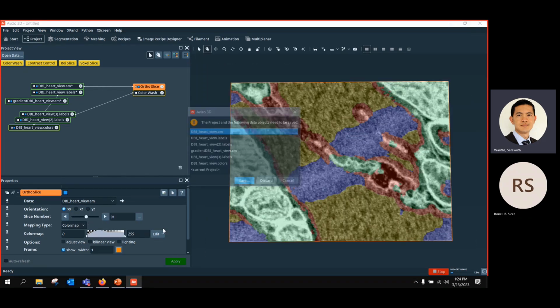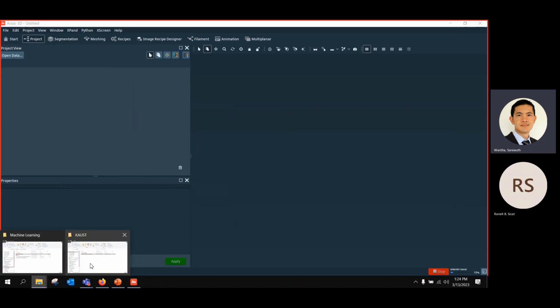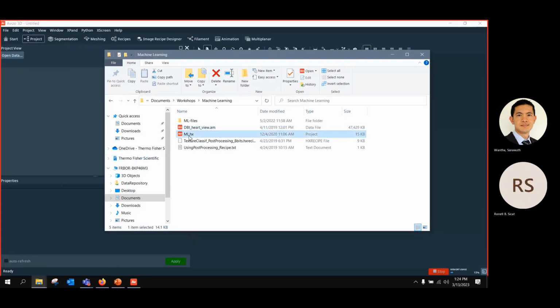And let me load this completed data that has been prepared before to give you an example.